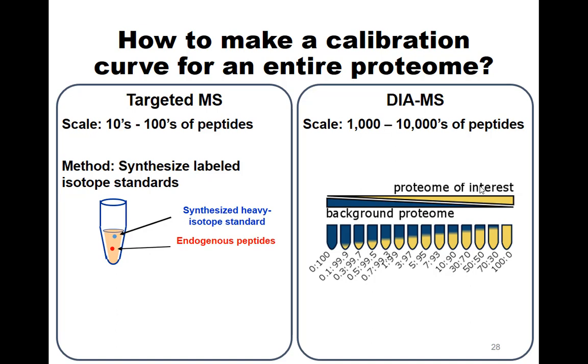So what I've been doing is using a proteome of interest. I'm doing every one of my experiments in yeast, so my proteome of interest is the yeast proteome. And then finding an appropriate background proteome to dilute my proteome into.